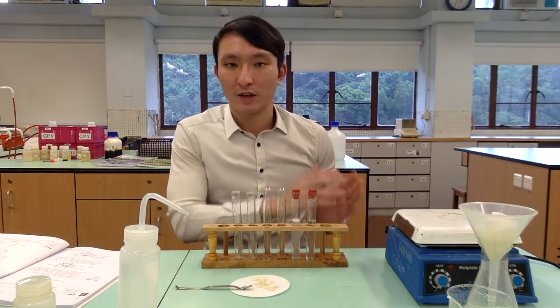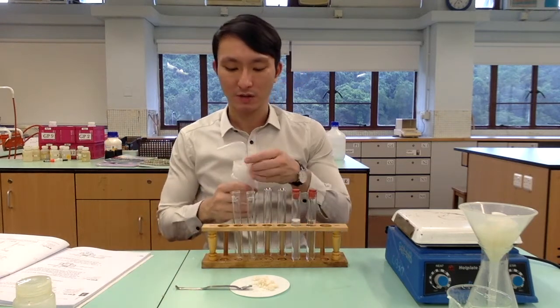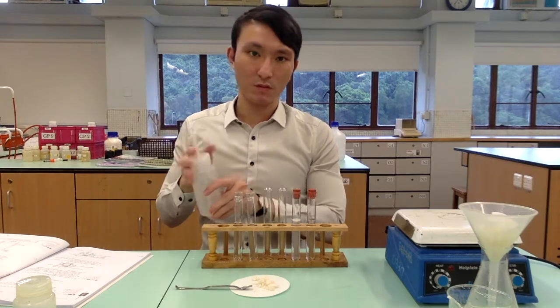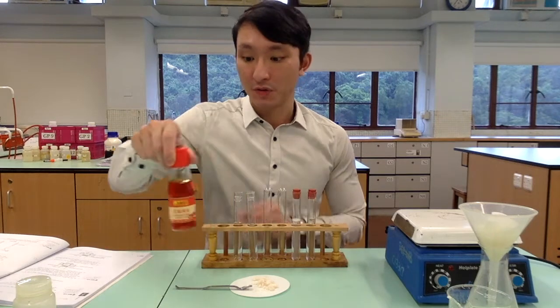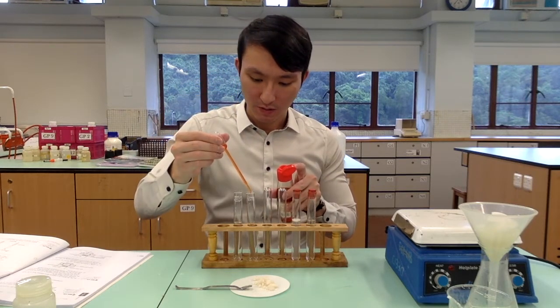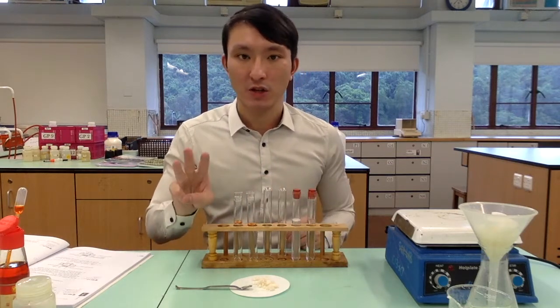Now we want to do another experiment to show the cleaning property of the soap. Again, we are going to half fill the two test tubes with distilled water. To that, we are going to add a few drops of chili oil. Chili oil represents the oil stain, and we want to see if the soap is able to erase it. Now, to one of the test tubes, we will add three spatulas of the soap.